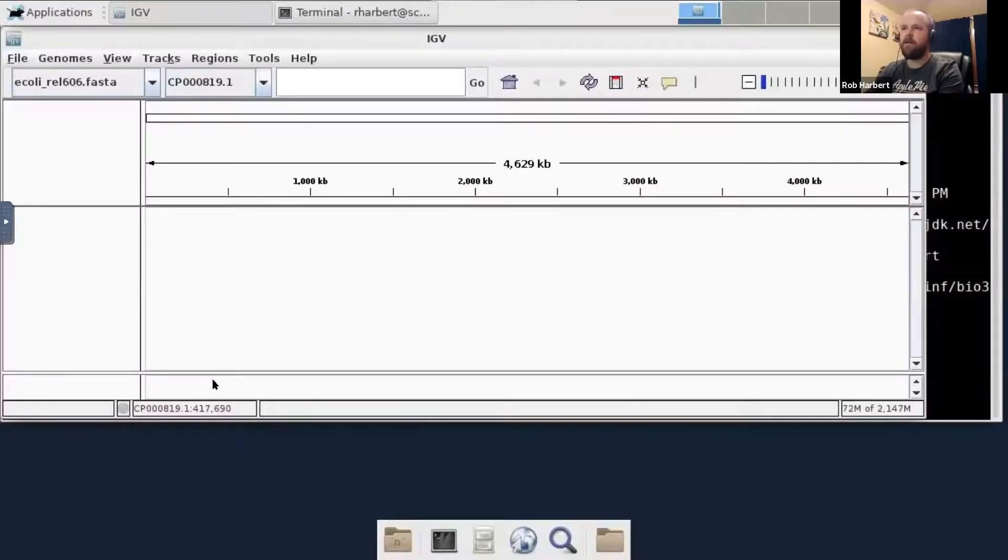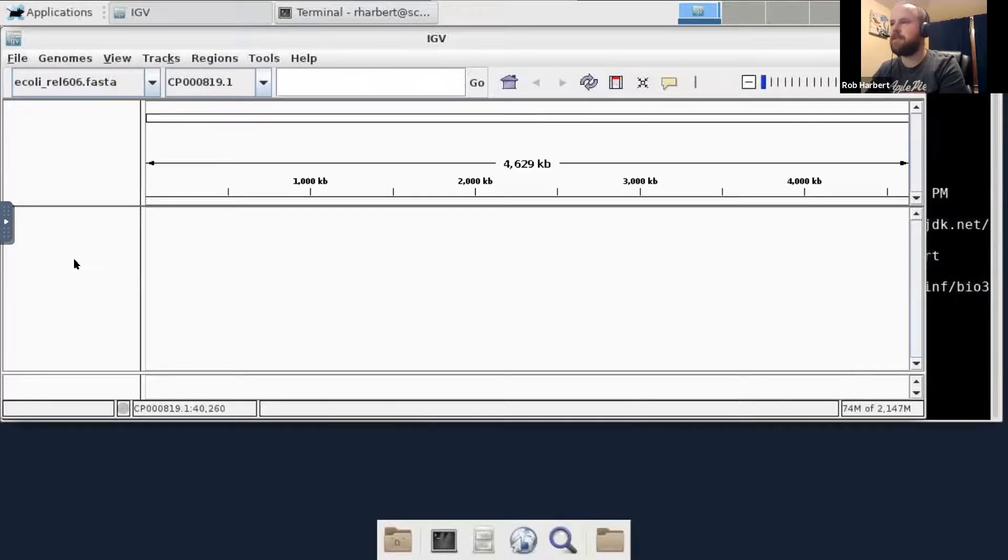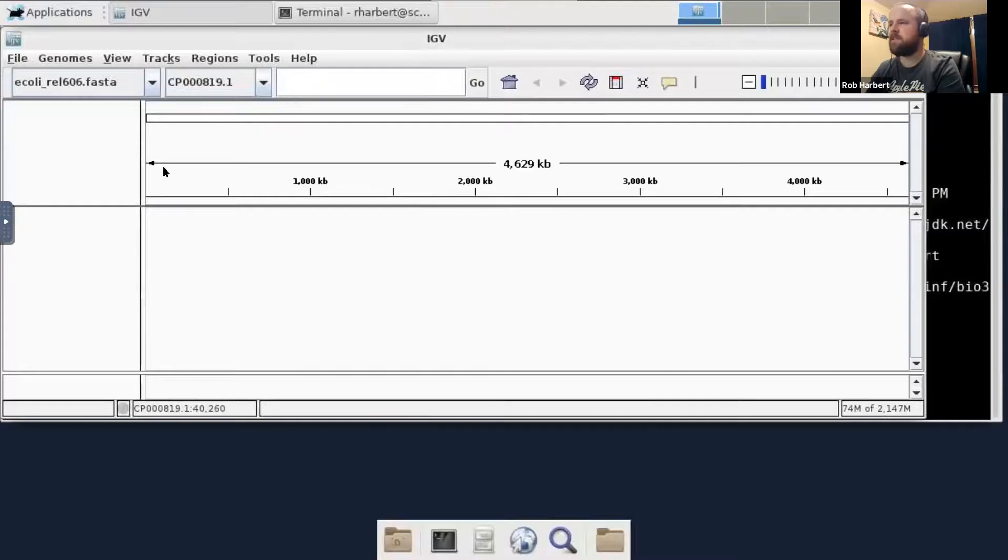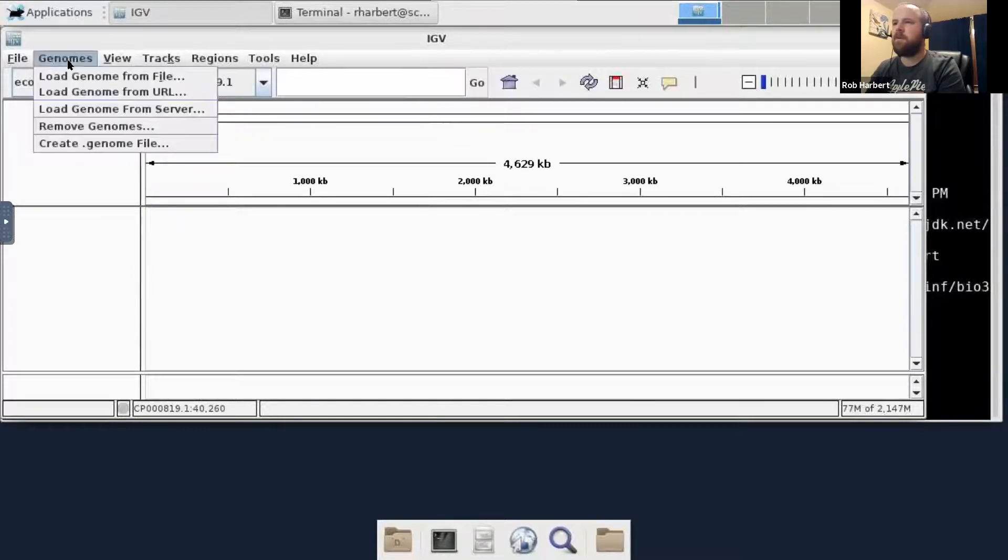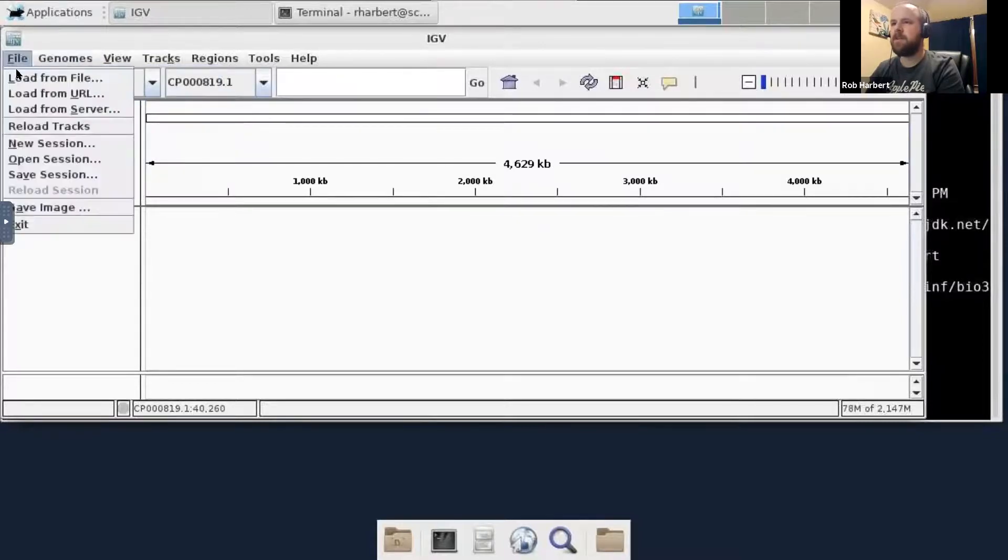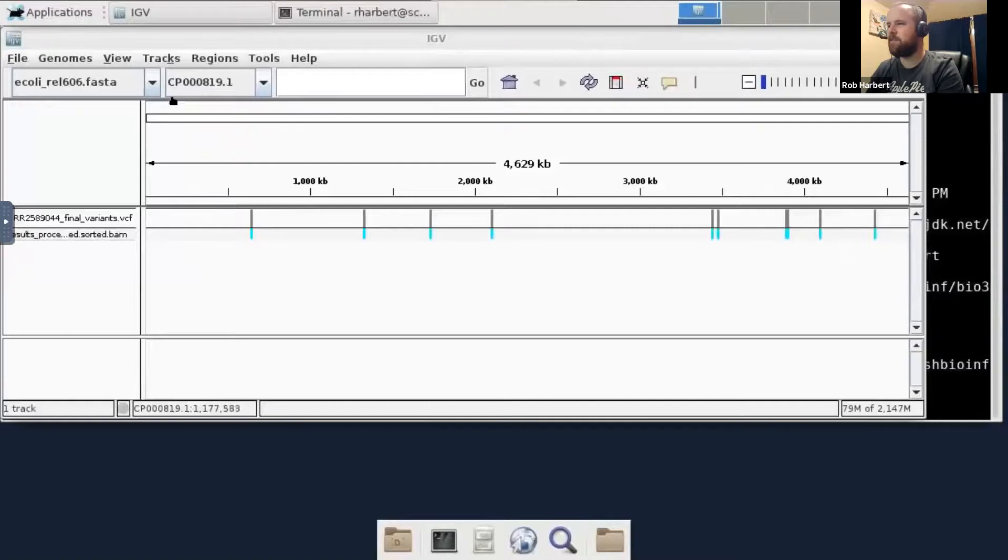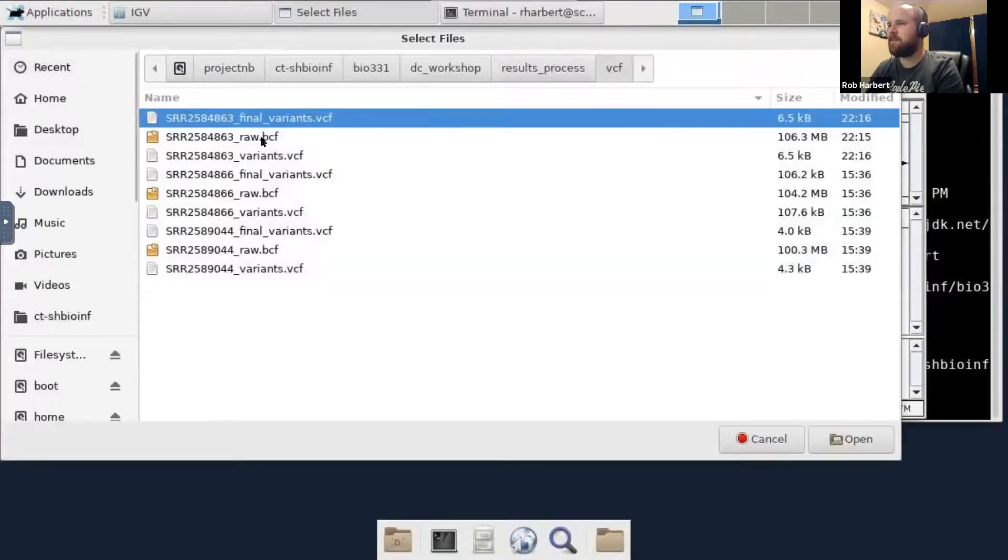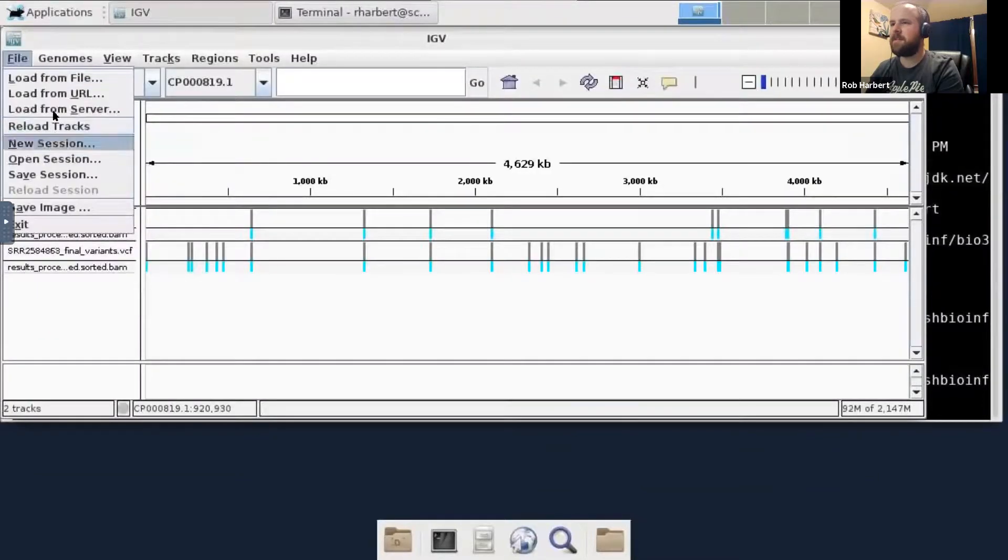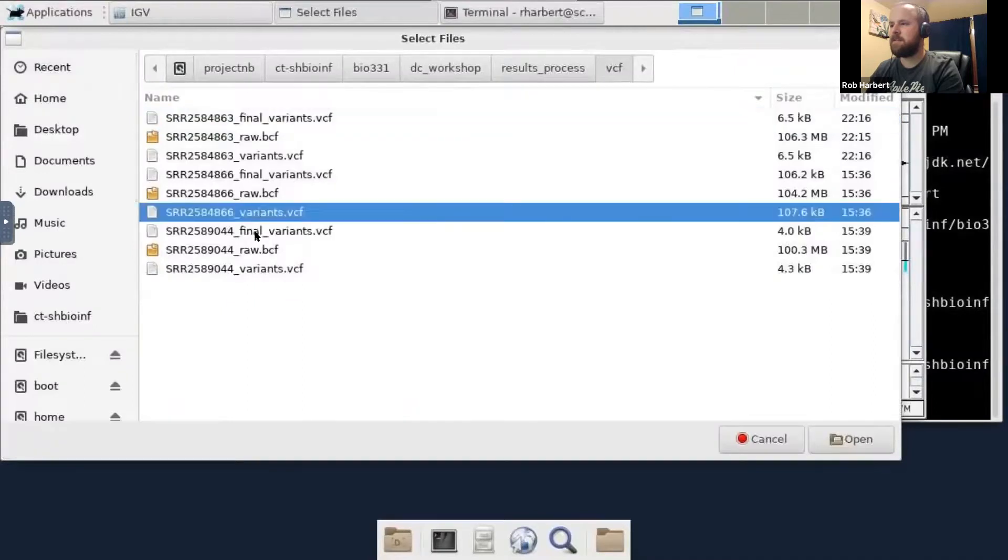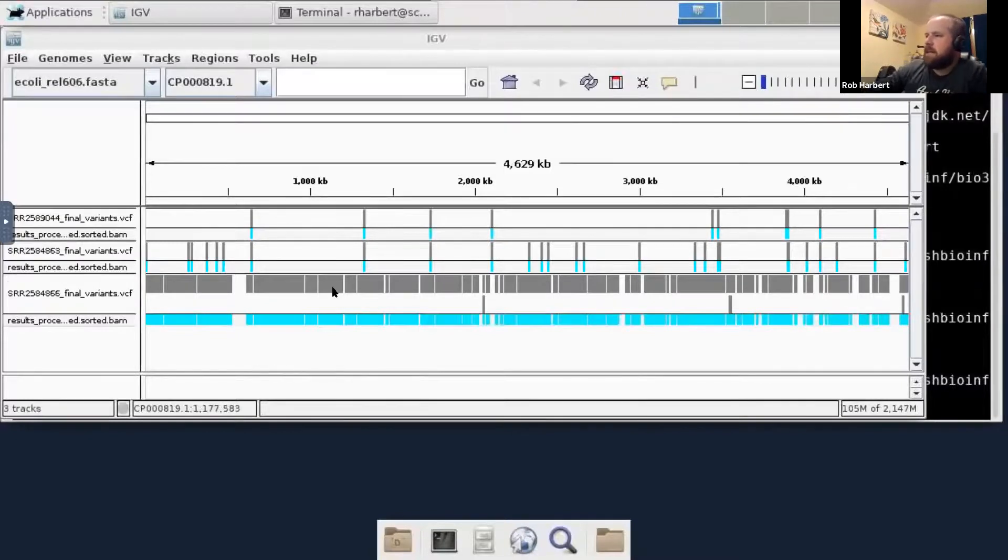Here we are in IGV accessed through a web browser, so it's a little bit clunky. You could install IGV on your laptop and download your dataset. So I have gone ahead and loaded the reference genome here, E. coli rel606.fasta, and you can see its genomic coordinates, all 4.6 million nucleotides long. We would load a new genome from file right here, but that's already up for us. So let's go ahead and load from file our variants. We're going to do 4.4 first, and then we're going to do 6.3, and last but not least, 6.6.